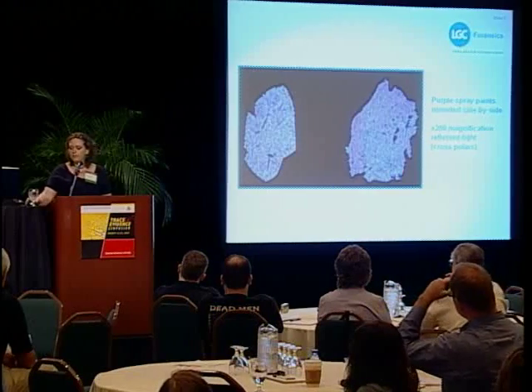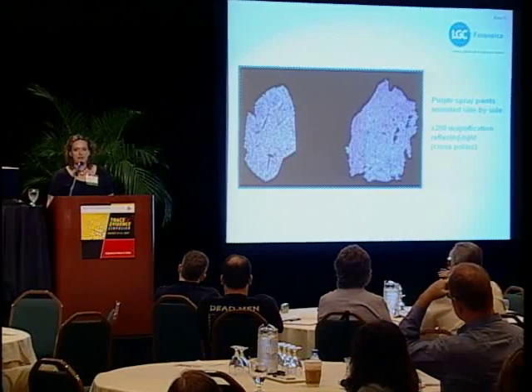each other. This particular case was a spray can that was received into the laboratory, had lots of controls, and I had the whole spray can really, so trace evidence perhaps is a bit of a naughty term for this one. This is lots and lots of sample. And on first glance, they actually look extremely similar colours. It's a purple spray can. We've got inclusions, these large particles in there, and it looks very, very similar.